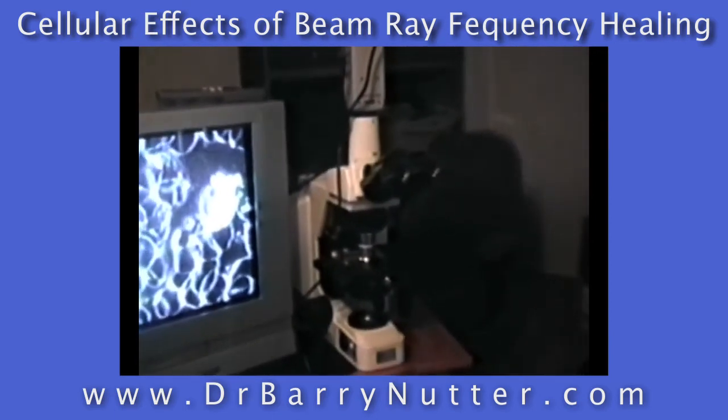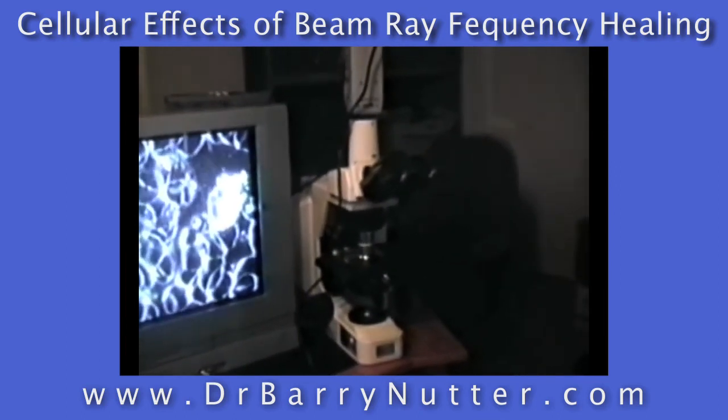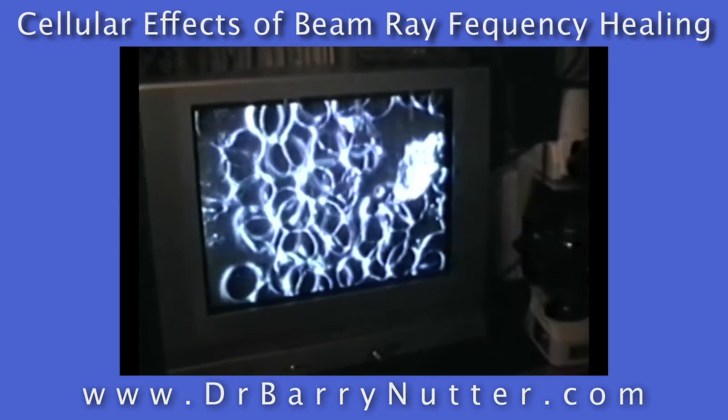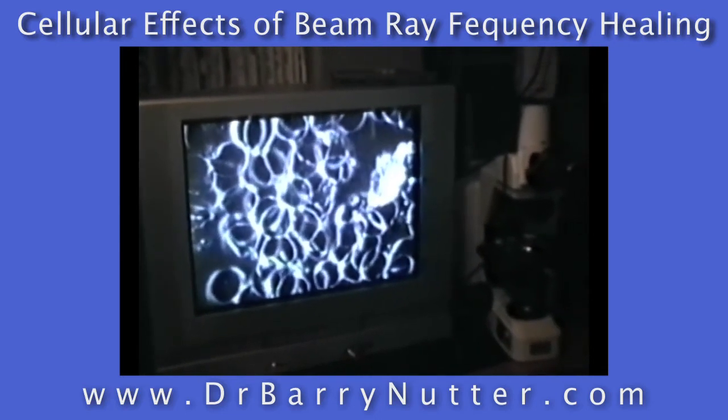This is the camera equipment, the Nikon Eclipse E600, that I'm using with a Sony camera, with a flat TV monitor, showing the blood cells magnified with a 100x objective.